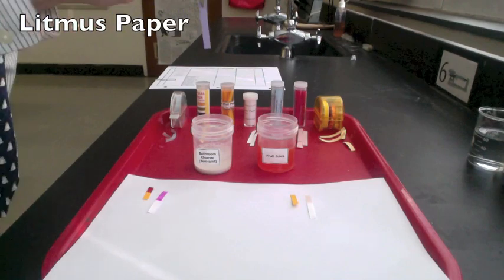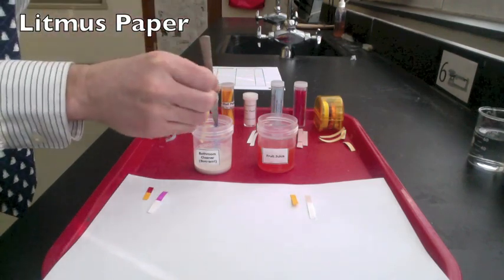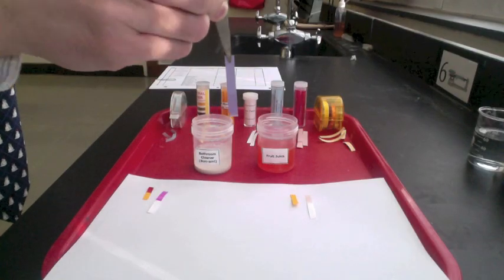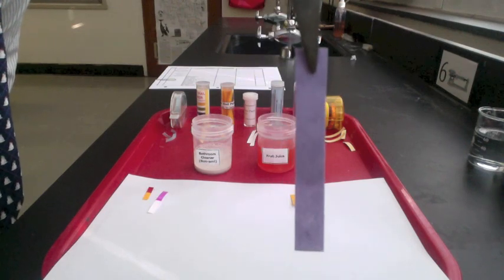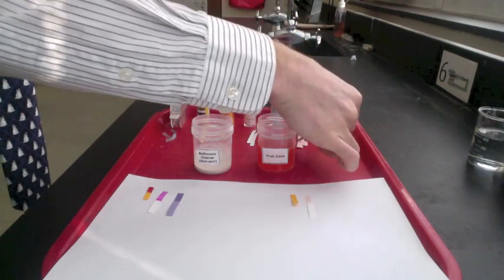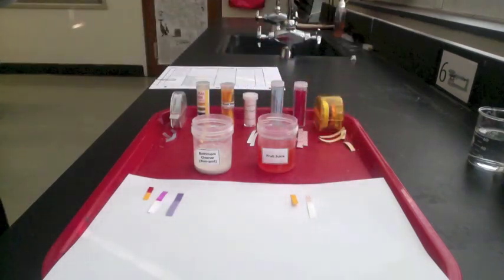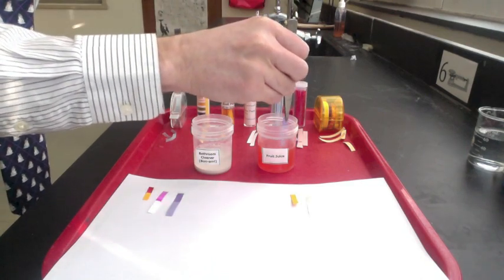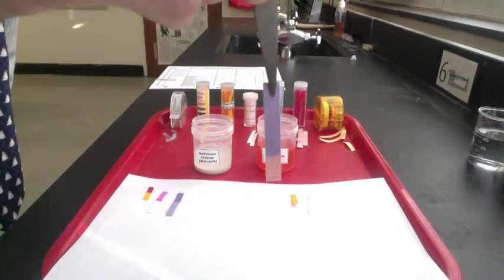Our next indicator is litmus paper. Litmus paper comes in two types: blue and red. Let's start with blue. Blue litmus paper turns red for acids. When dipped in the cleaner, the blue litmus paper stays blue, which tells us it's either a base or neutral. When dipped in the fruit juice, the blue litmus paper turns pink.